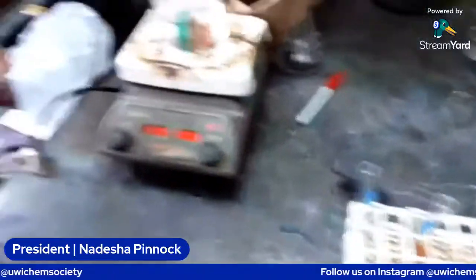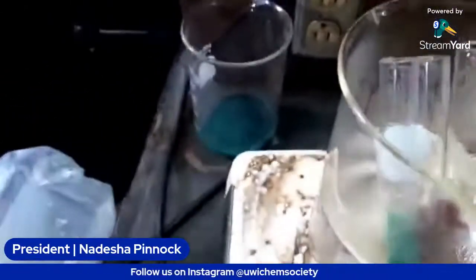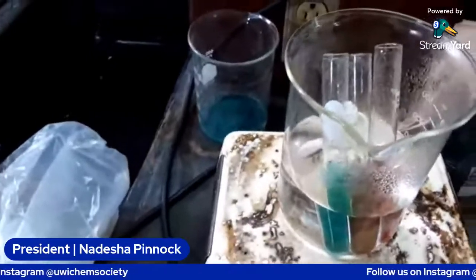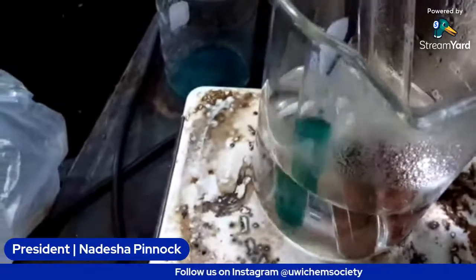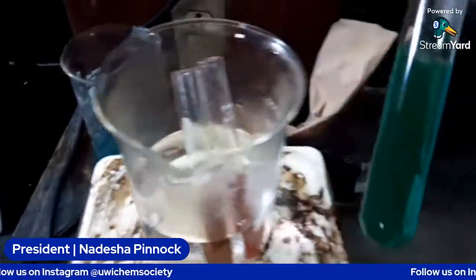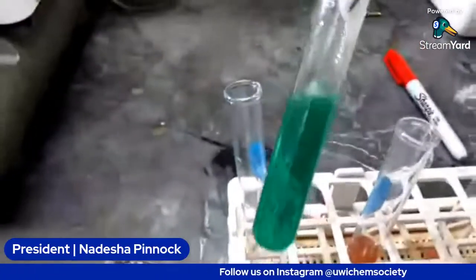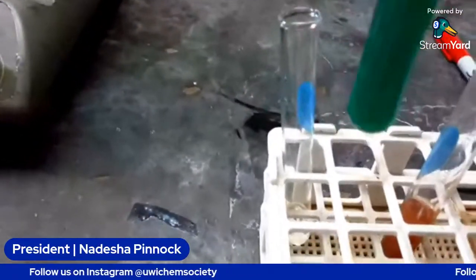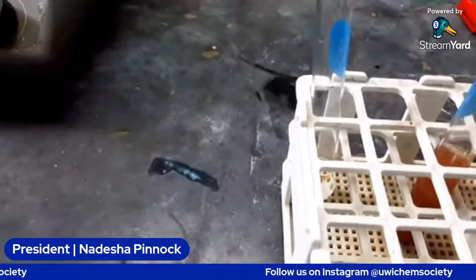Of course I'm not sure which one this is because the labeling came off, but we're going to label them at the top or use tape or something to get it done and do it over again. So this one is still blue. Not sure which one this is. Well, it's kind of green, to be honest. Blue green. But there's no precipitate in it.